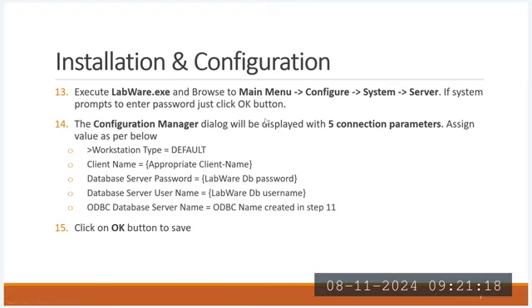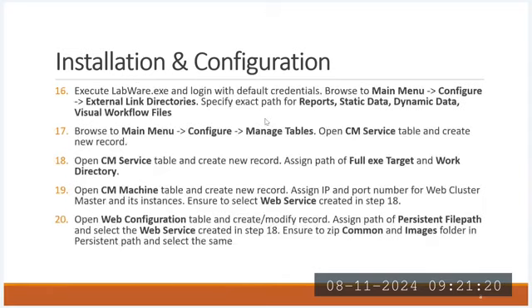The way I have communicated server details, in the same way I have to update the reports, static data, dynamic data, and visual workflows. First, I want to confirm a few steps. What are the reports? The way I have communicated earlier, each and every report related to SAP Crystal Reports, I have to update on the Crystal report basis. Once I place the reports in the specified folder, I have to update the respective path in the reports structure.